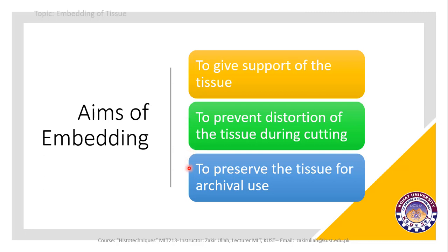If any tissue is embedded in a medium, then we can place this tissue for a longer time for study purposes or for repository in the library for future use or future research.